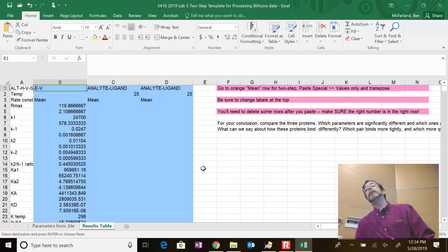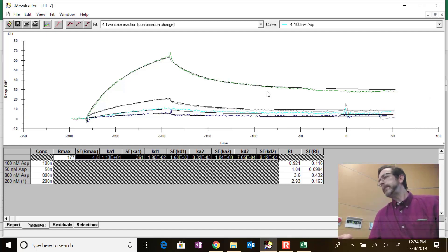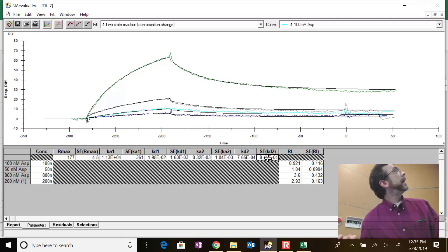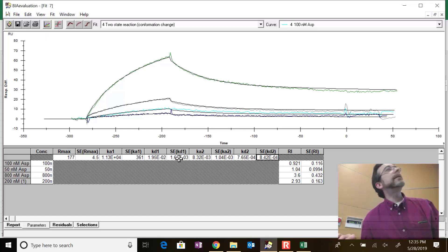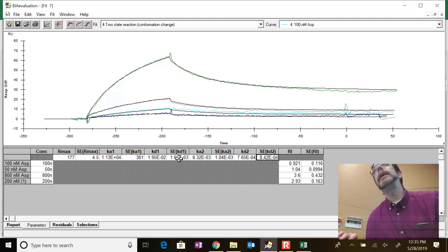When looking at the two-step fit, notice there are now two curves giving a much better fit with a big curve. But look at the errors: KD2 fits really nicely but has a large error, and it's also pretty flat - 10^-4. Are we really measuring anything there? That's why I might not use the two-step fit. The other errors seem in order, but don't waste too much time trying to get low errors for the two-step fits - they're probably pretty sketchy to begin with, though the math is really cool and in some cases can be justified.